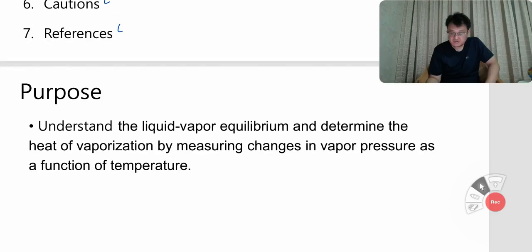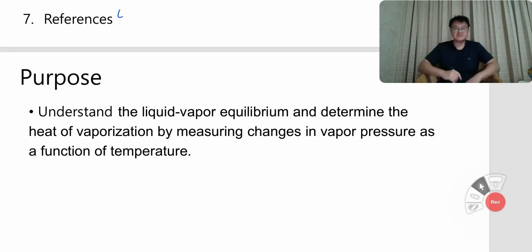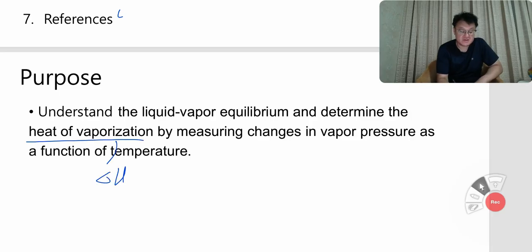So let me start with the purpose of the experiment. In this experiment, we would like to gain understanding about the liquid-vapor equilibrium and determine the heat of vaporization, which is generally represented as delta H vap, by measuring changes in vapor pressure as a function of temperature.